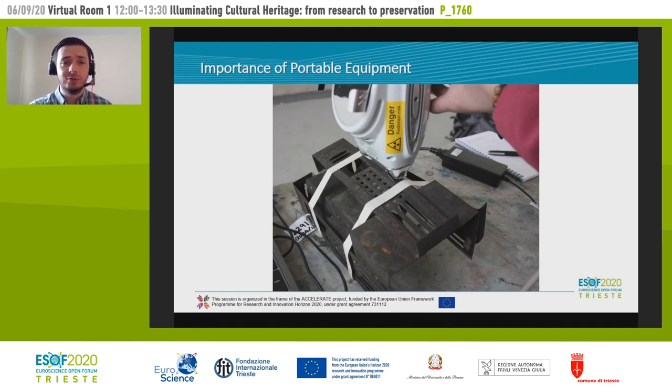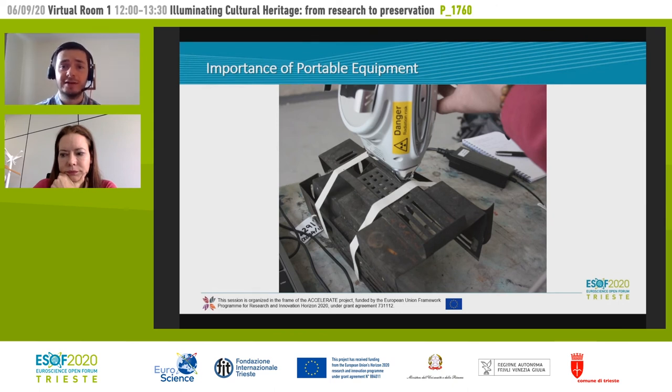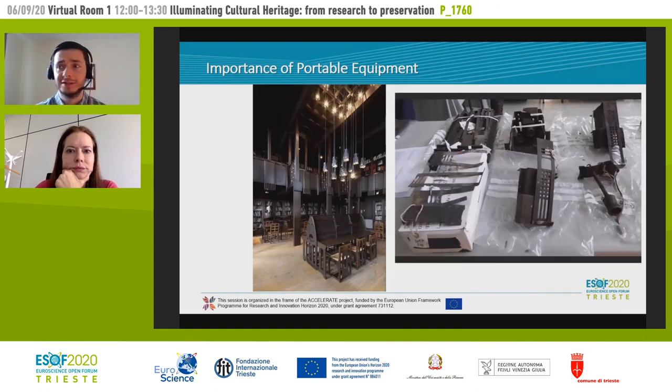One quick example where this has been used really successfully was using our portable X-ray fluorescence to look at the library lights at the Charles Rennie Mackintosh Glasgow School of Art. That suffered a horrific fire in 2014, which completely destroyed the library, which we can see in the image on the left. Part of this were these hanging lights, which were destroyed during the fire. Each light was comprised of many different individual components. These fell apart into over 600 separate pieces during the fire.